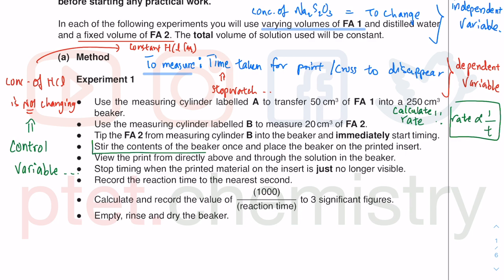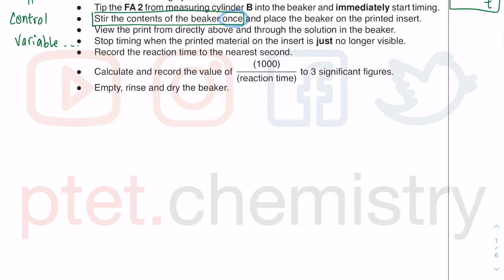The question says 'stir the contents of the beaker once.' I've seen students doing this experiment and stirring multiple times. Your supervisor will be doing the actual practical, so follow the instruction. It was stated in the syllabus that candidates should be able to read the instructions. If you stir more than once, you're going to affect the rate in terms of how often the particles collide, and therefore your result might differ from your supervisor's — which will result in loss of accuracy marks.